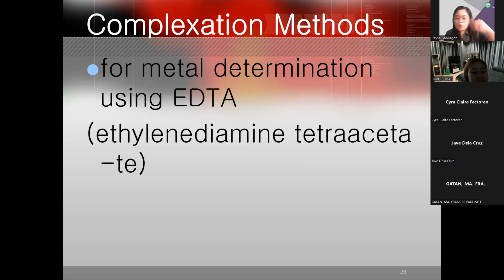So we need to analyze the lipsticks first before using them. And what we do is just introduce it to the AAS. That's the machine, atomic absorption spectrophotometer.